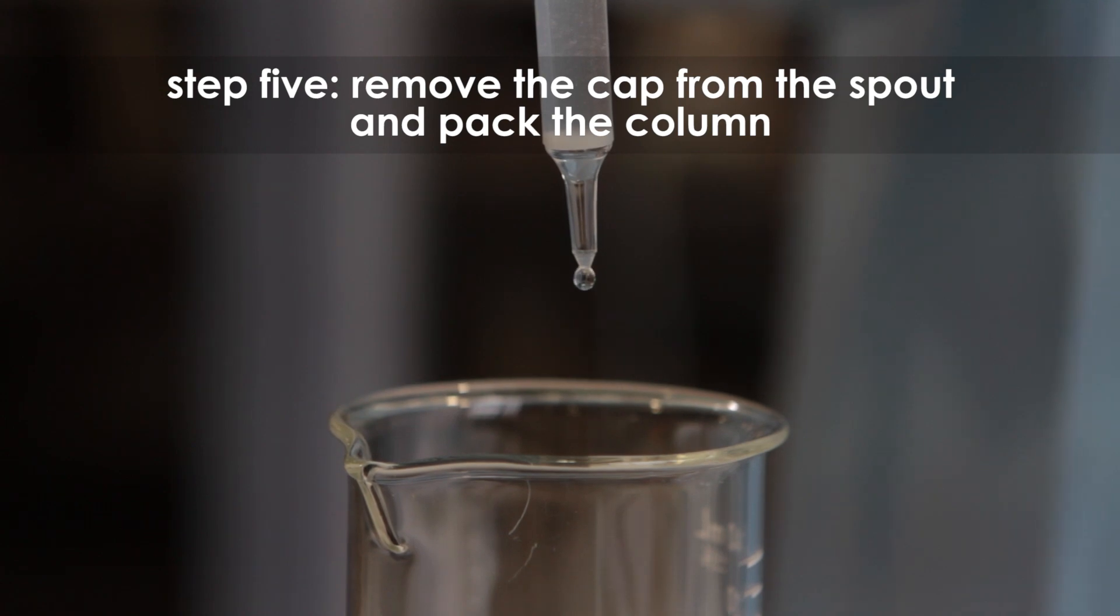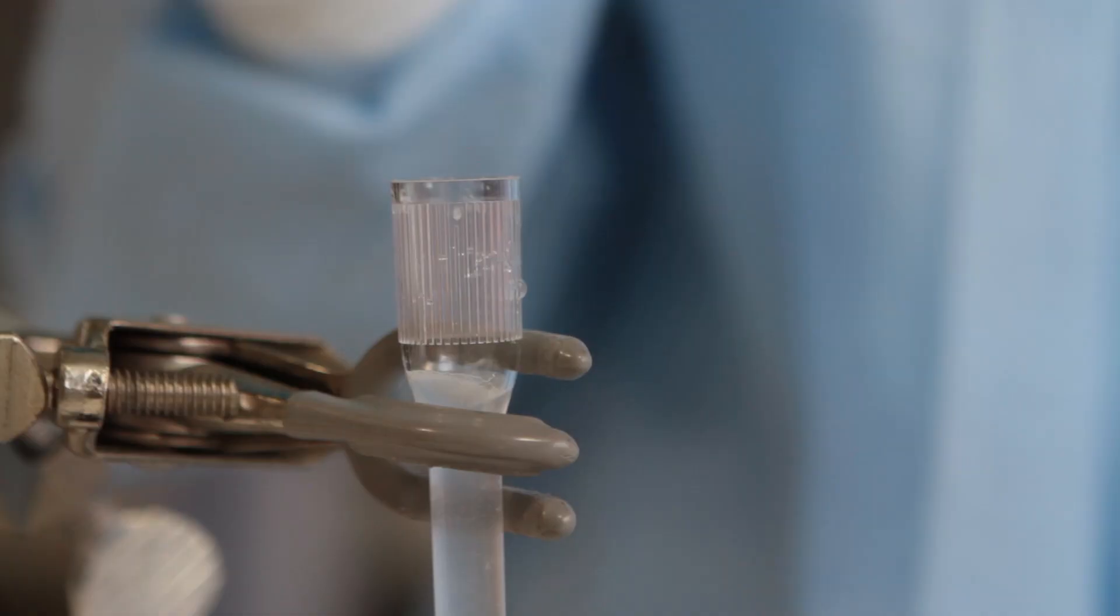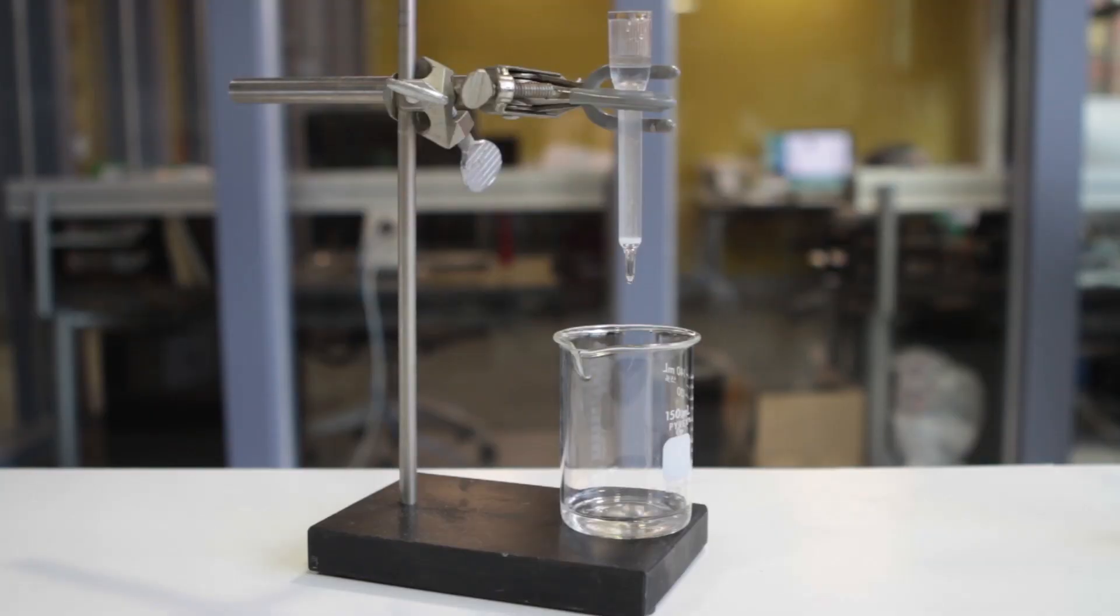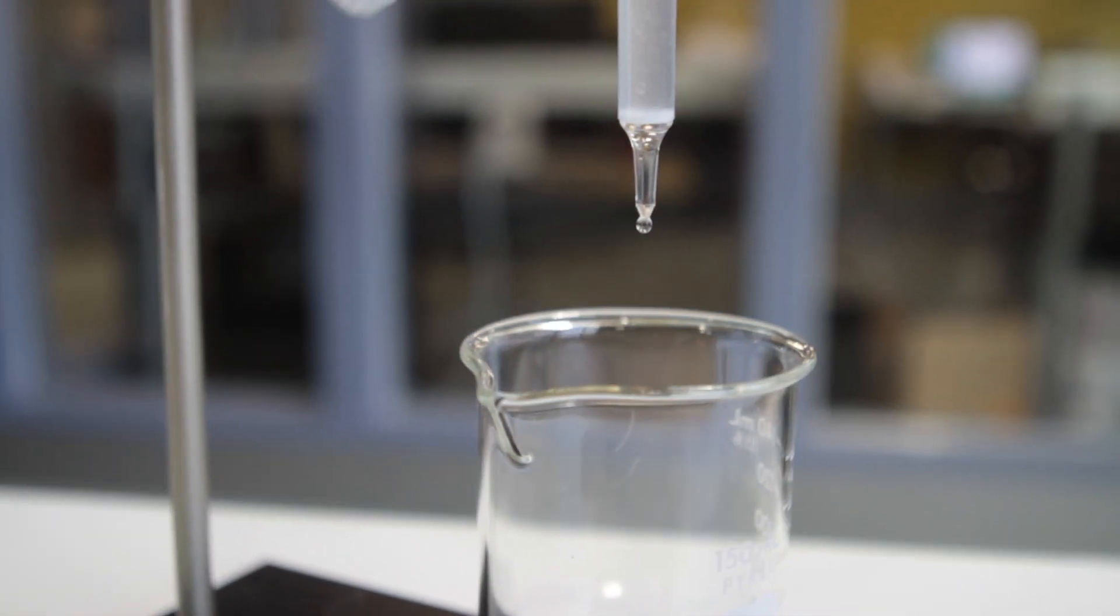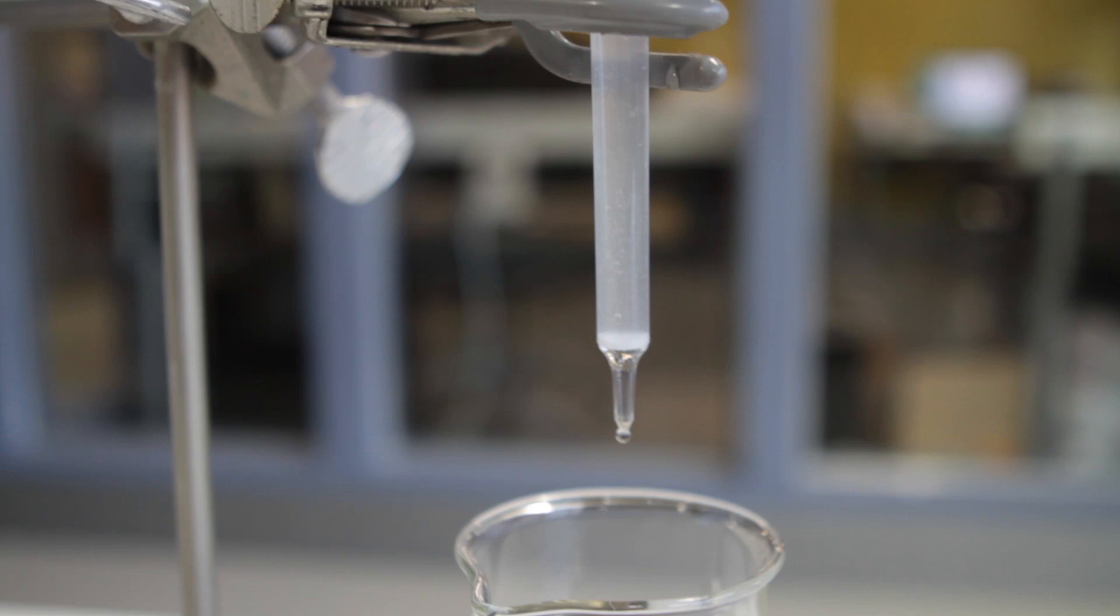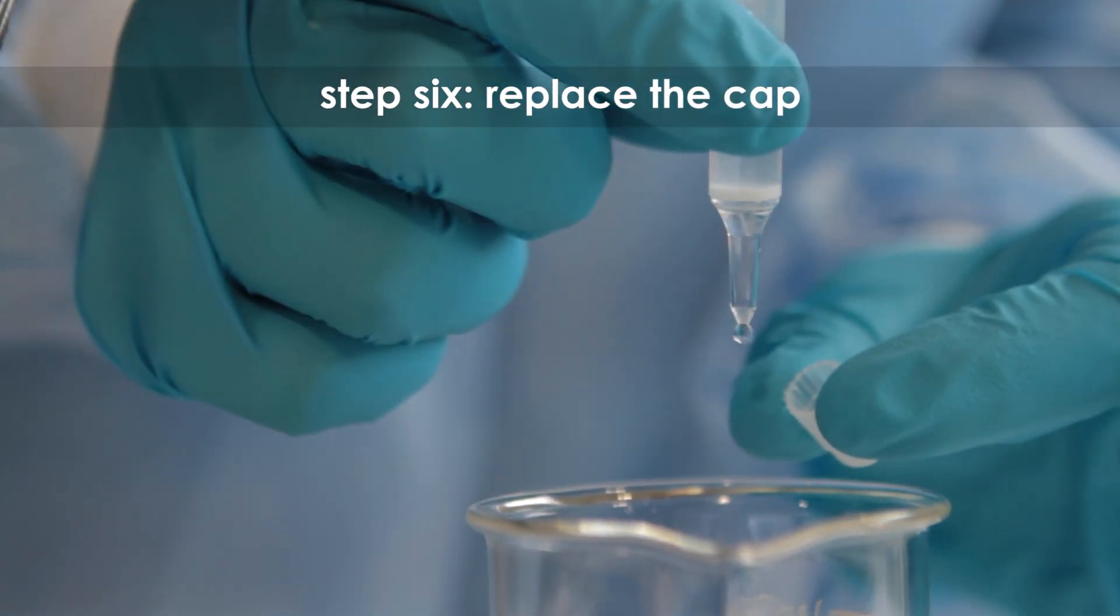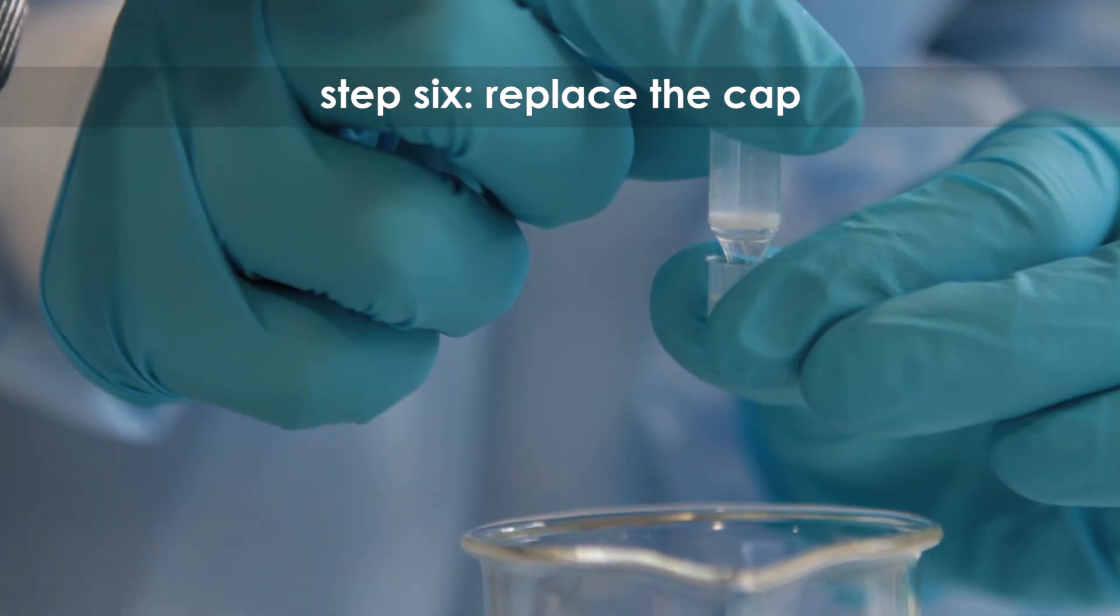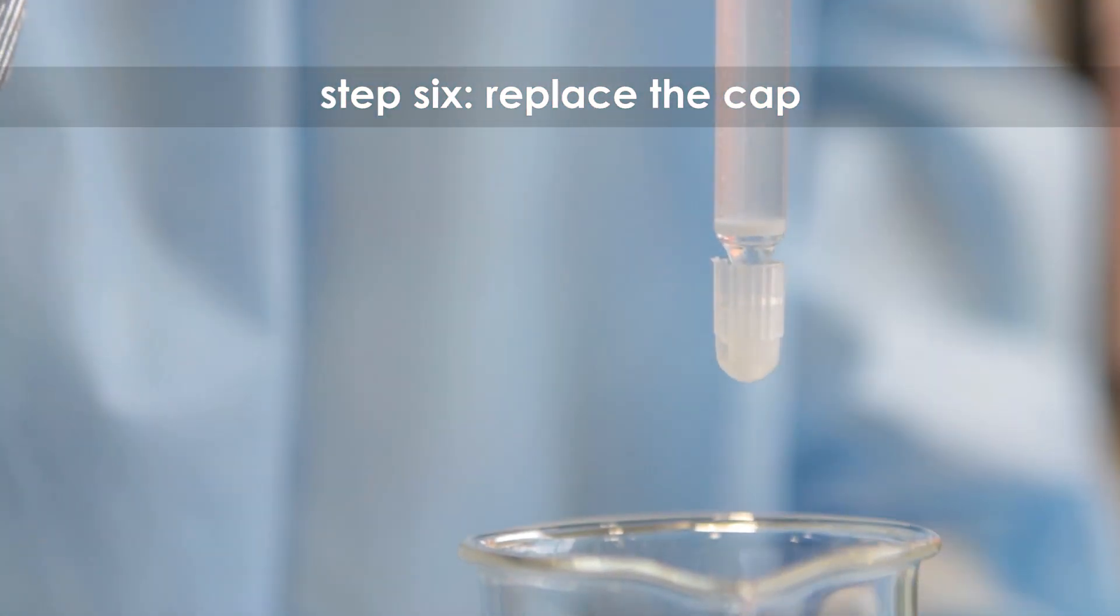Pack the column by allowing the buffer to flow through the column. Add buffer to the reservoir when necessary. The column is packed when the matrix stops compressing. Step 6: Replace the cap onto the spout of the column.